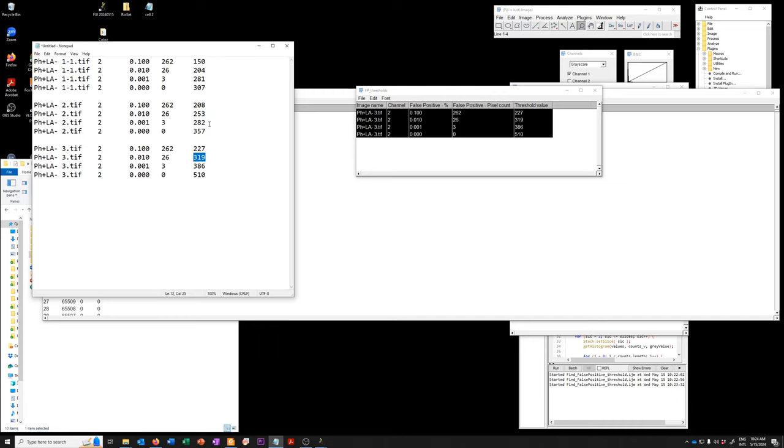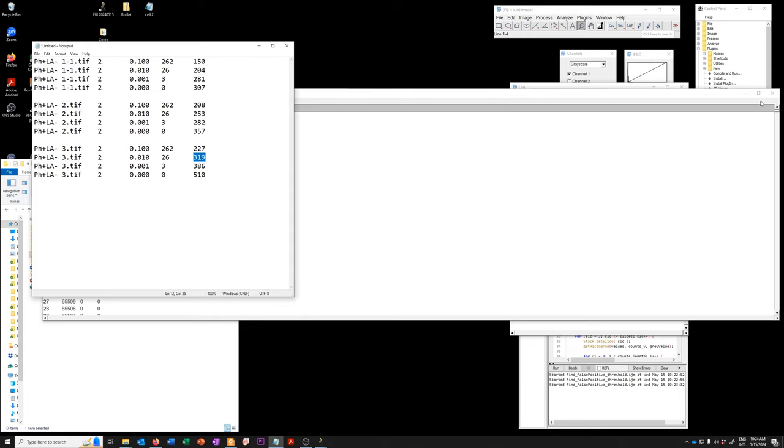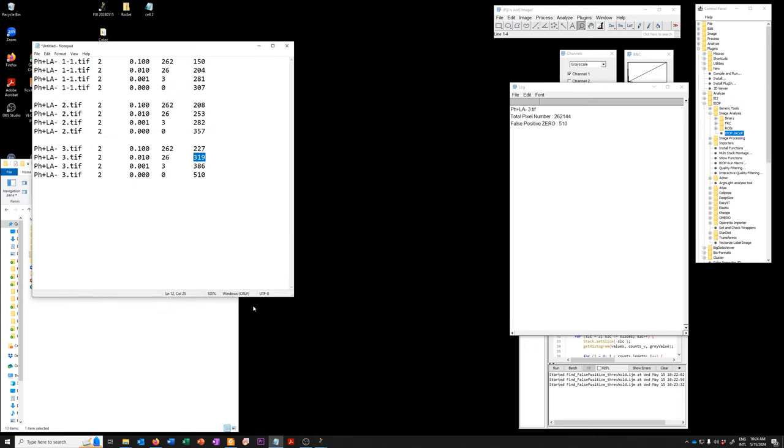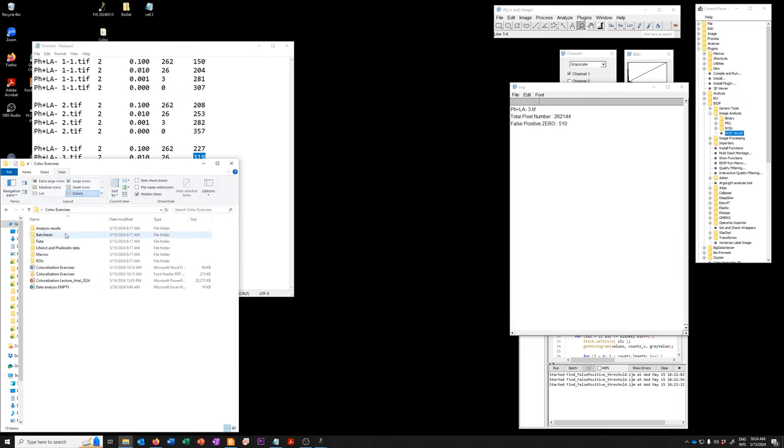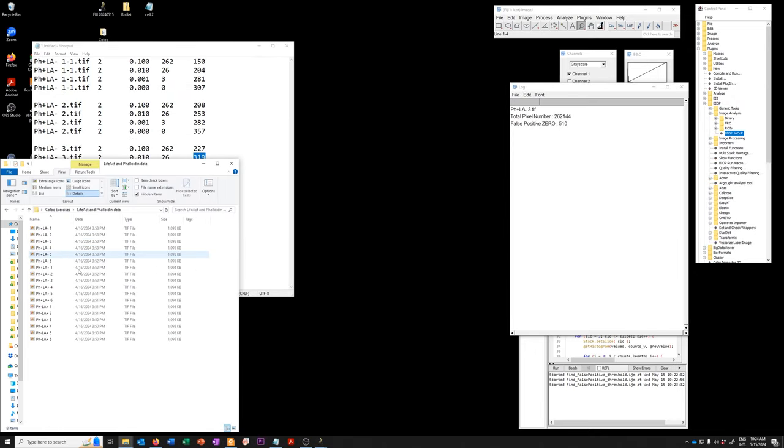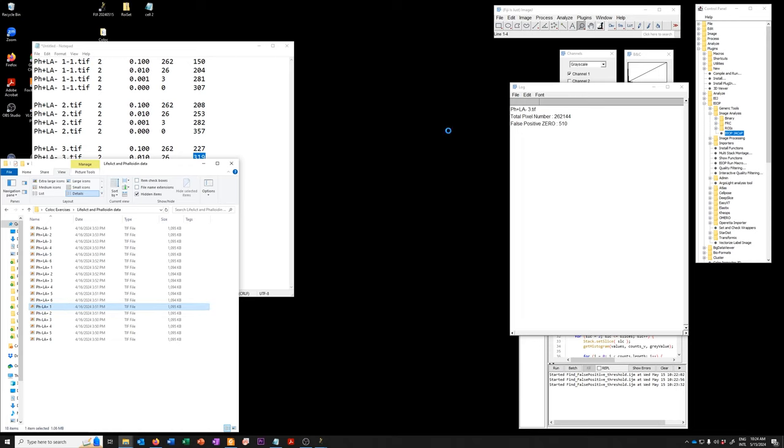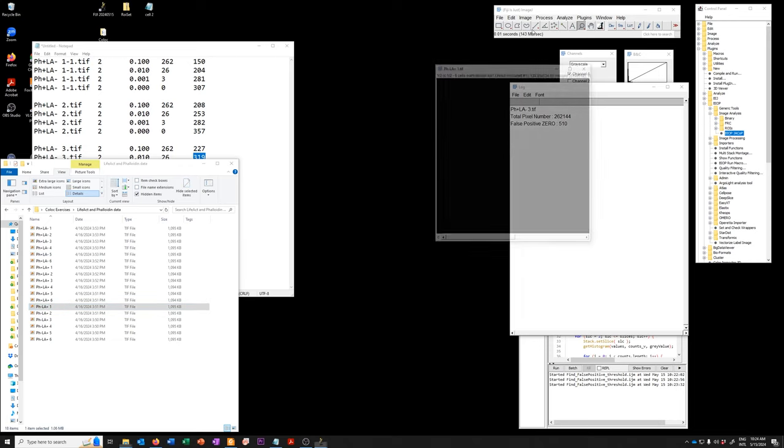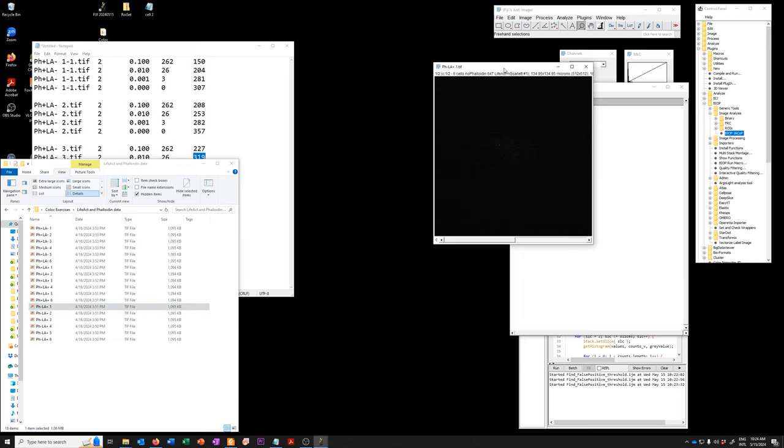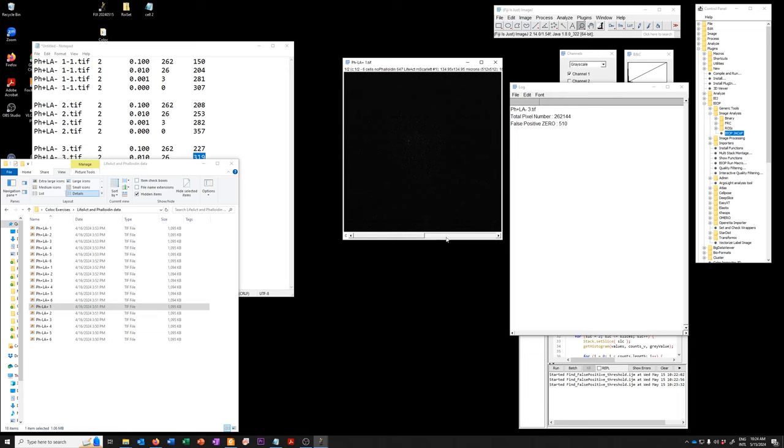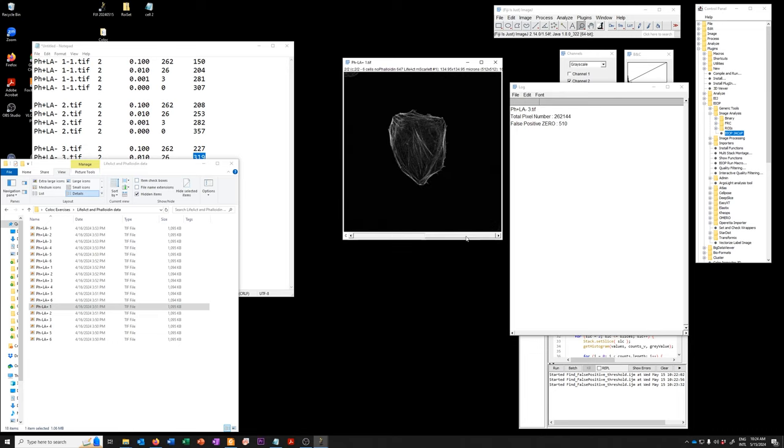So let's check whether those thresholds make sense by looking at some of the images that do have LIFACT. So for example, I'll use this one. So this one doesn't have phalloidin. Here's the LIFACT signal.